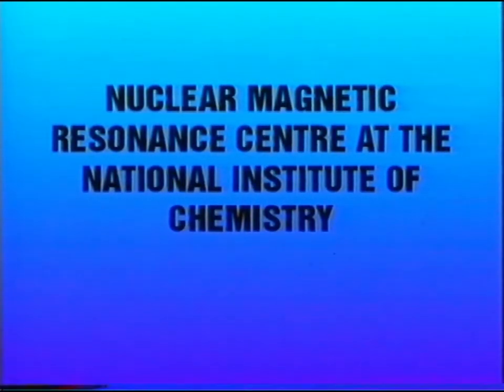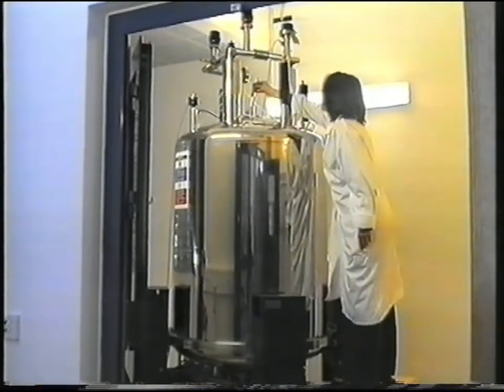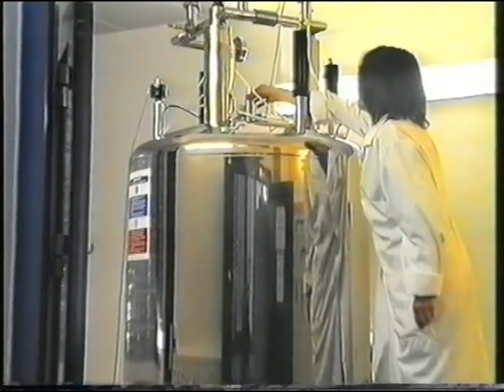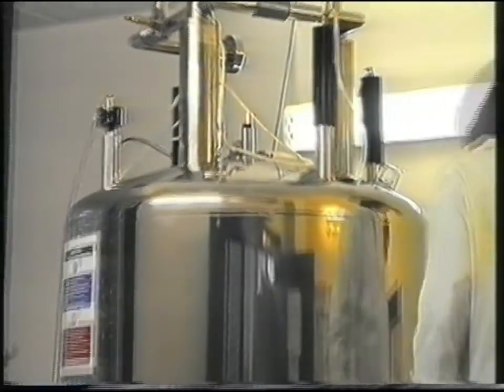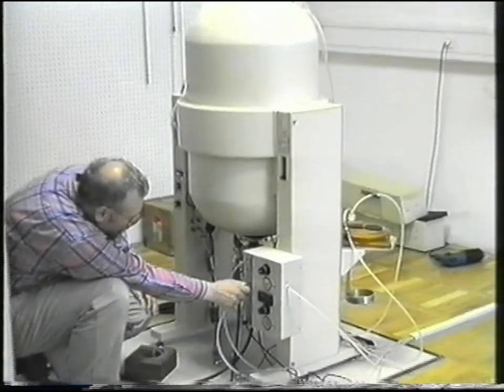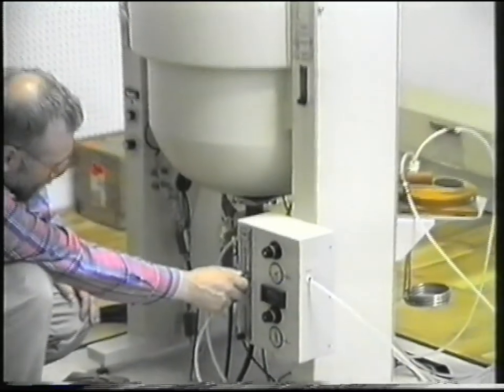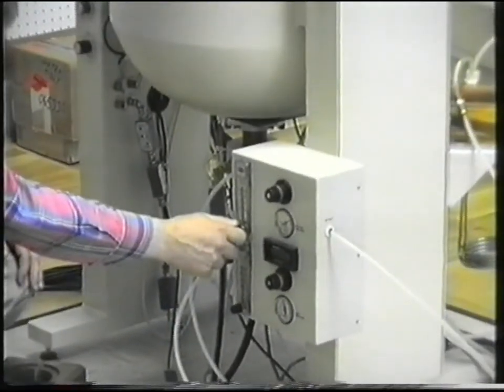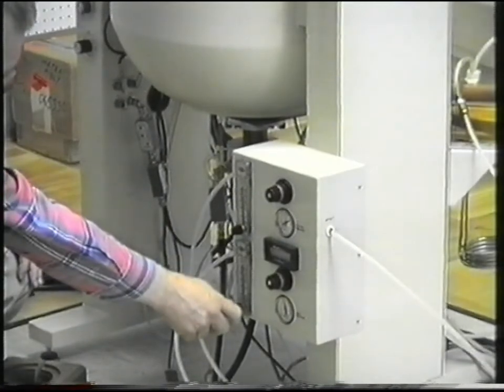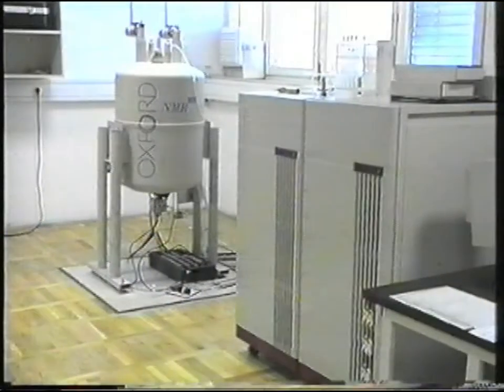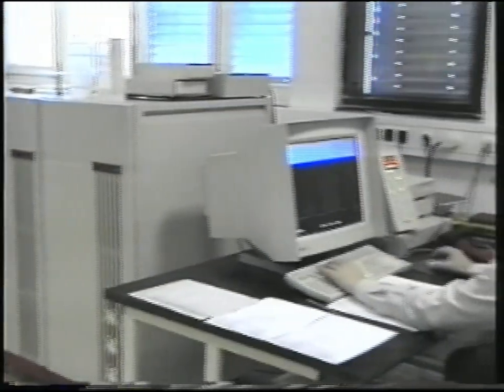The NMR Centre offers infrastructure and service for the collection and processing of NMR spectra to all institutions and companies that use NMR in their research. The 600 MHz spectrometer is used in the study of the three-dimensional structure and dynamics of complex systems with a high molecular mass, while two 300 MHz instruments are used by synthetic organic chemists.